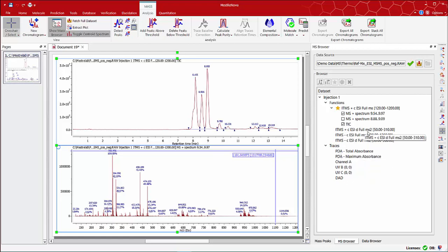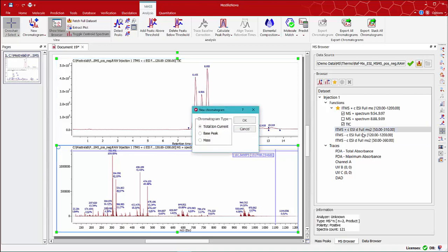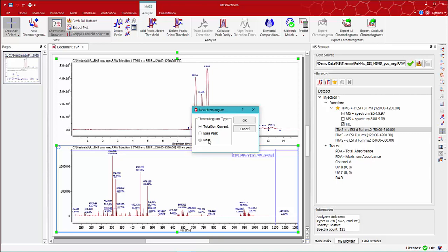If for instance you want to display the MS-MS, double click and a window will display the new chromatogram options such as total ion current, base peak or mass chromatograms for a selected range as we've already displayed. This is equivalent to the selected button on the main toolbar.